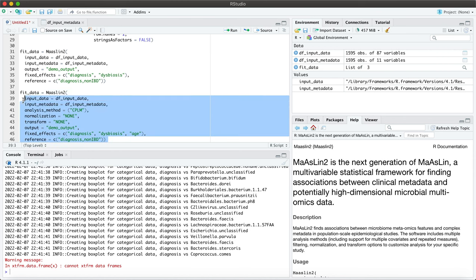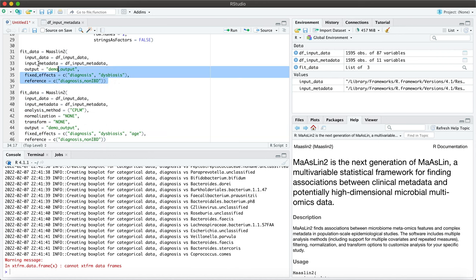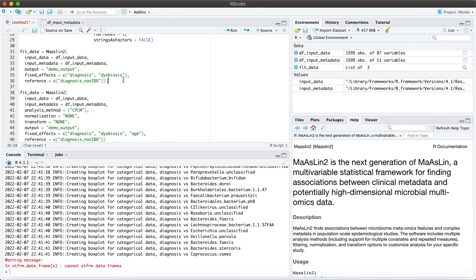Okay so I won't run this just to save time, but let's look at the output data from what we ran prior. And this is what's in the developer tutorial as well, so you'll be able to compare and contrast with that.